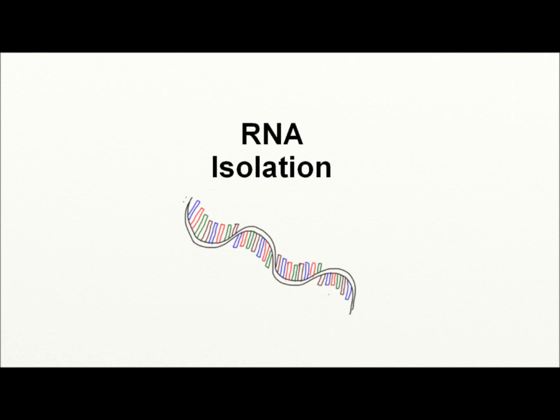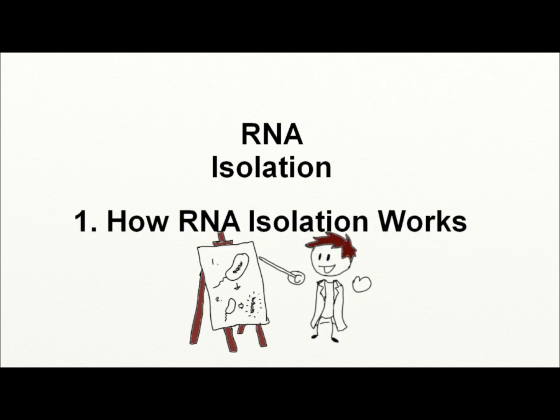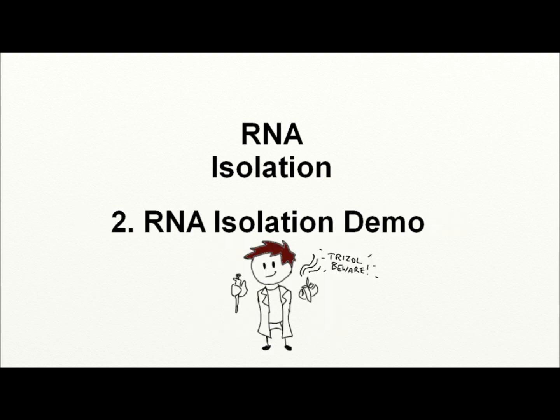Today, we are going to discuss RNA isolation. We'll first discuss theory behind how RNA isolation works, and then we will demonstrate the steps it takes to isolate high-quality RNA. Let's discuss the background behind RNA extraction first.